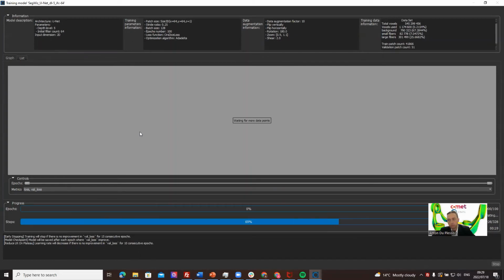There's also the smart grid tool, which is quite useful in 2D. It does a local watersheding, which works quite well on some kinds of data. And there are some other tools, of course. You can also manually just paint by using the full brush and zooming in and out.